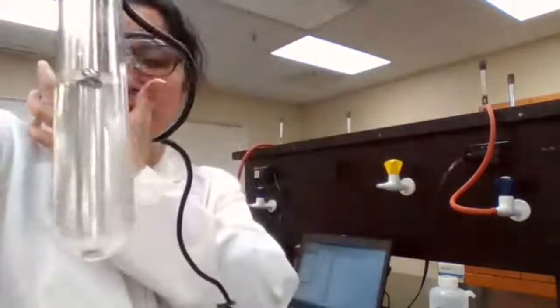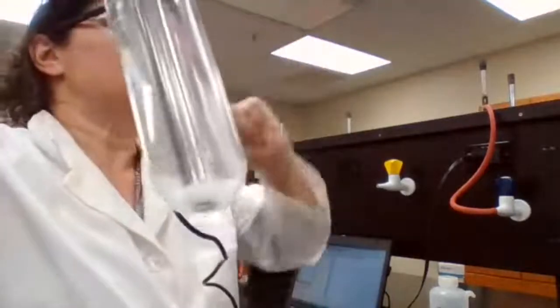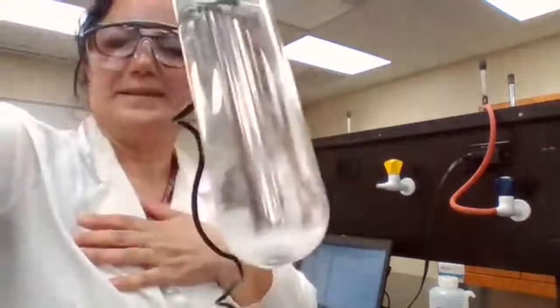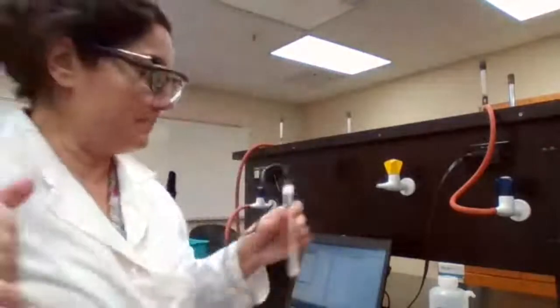What temperature did I say? 24.6? Okay. No need. Thank you. It worked. Yes. They have to go just slightly lower. Okay. You record that temperature? So that's the temperature that you record for test tube number 1.